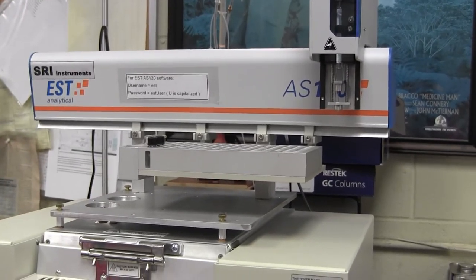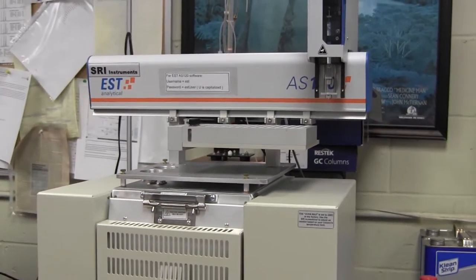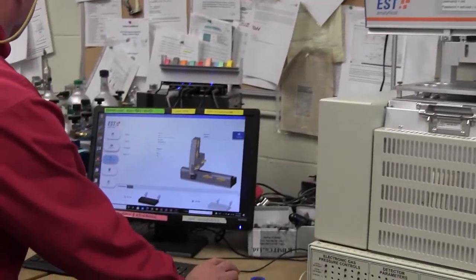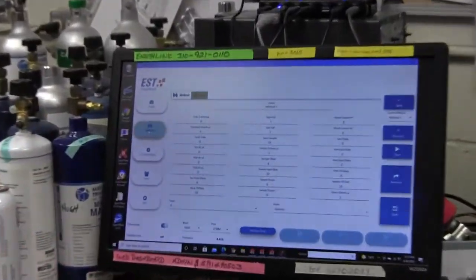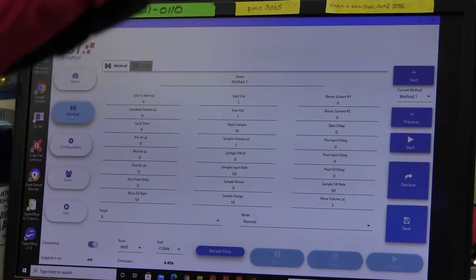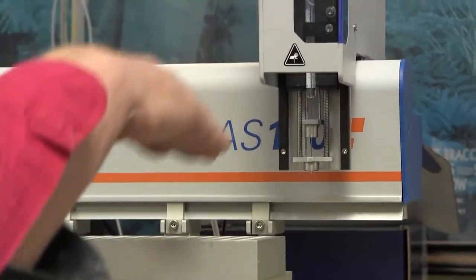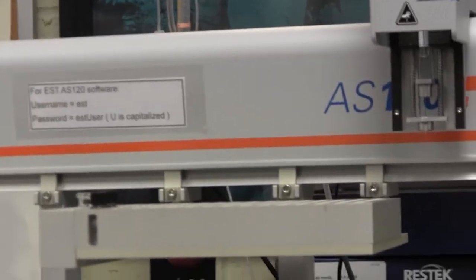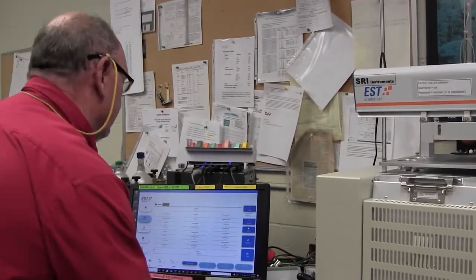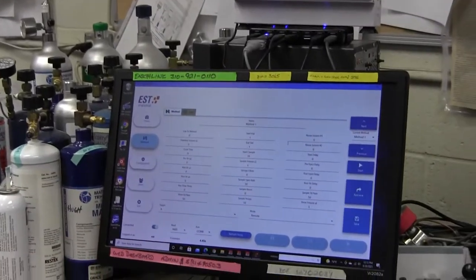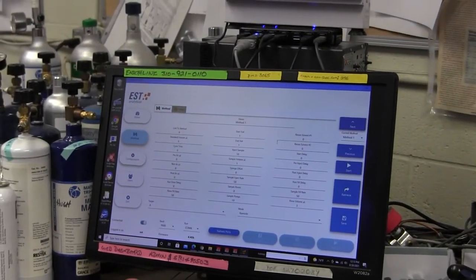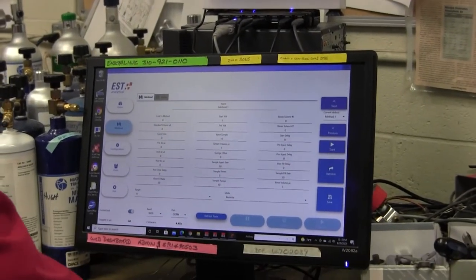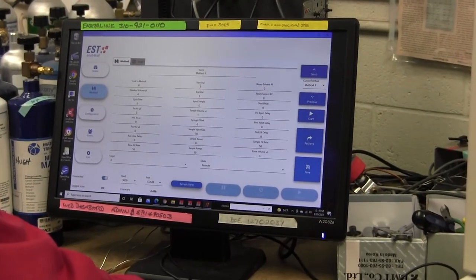So now that we're confident that the auto sampler knows where the various vials and injection ports are, then we can proceed to the method button here on the software. So the method button lets you specify all the various parameters that you can use to control the auto sampler. You can control how much volume is injected by the syringe. You can control the speed with which it sucks the sample up. You can control the speed with which it dispenses the sample. You can really do a million different things and we don't really have time to explain each thing. Most of the things that you would want to do, you probably won't need to do. They're there as optional features that you may or may not need. The ones that you will need though are the start vial. You have to tell it which vial to start with.